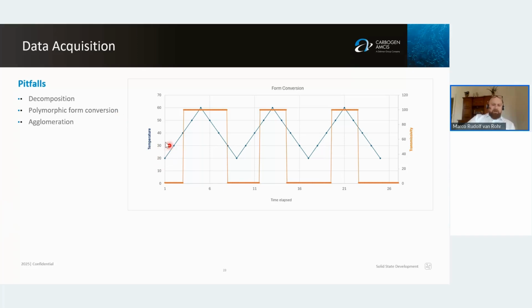So I'm warming up, same situation as before, clear point of 40 degrees Celsius, but the next one is a 45, and the next one again is also 45. So I have different solubility here than I do have here. So this is an indicator for the formation of a thermodynamically favored form compared to what I had here. I really have to question this data.